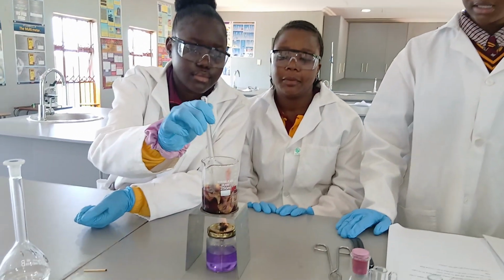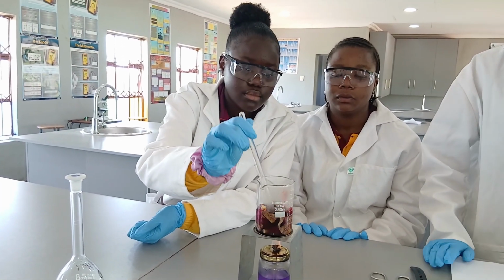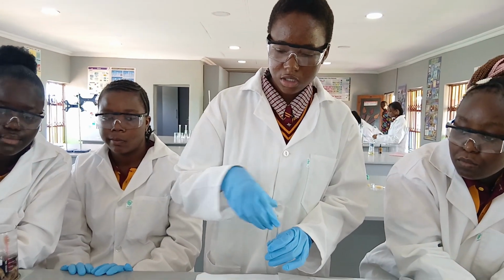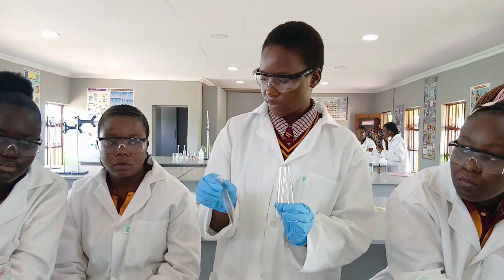As our solution is burning up, I was extracting our color. We're going to be stirring our solution using a stirring rod to make sure that we get the color from each and every flower that we have put into our solution. And as our solution is burning, we're going to pour some of our solutions into these test tubes. We have test tube 2, 3, and 1.